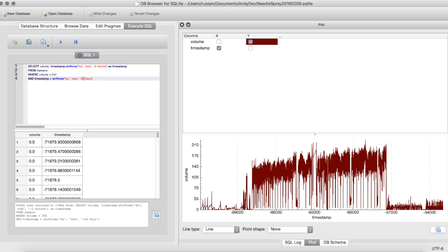However, in the development of the tools, some observations have been made. First, the droplet size control is quite robust. That is, the image recognition is able to accurately recognize the droplet size over the range of interest. Secondly, in spraying methanol, periodic bubbles have been observed. And you can see these identified by the regular dips in the data. The cause is uncertain, but heat from the lamps or the surroundings is suspected.